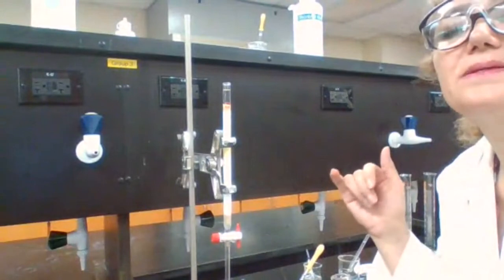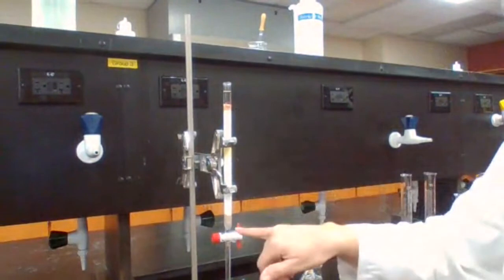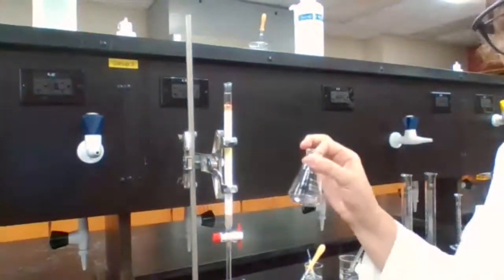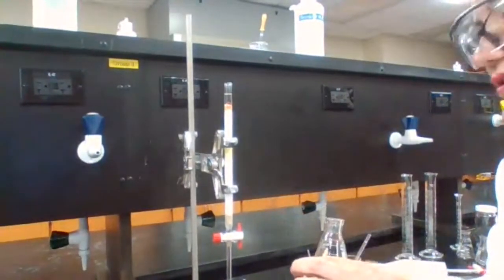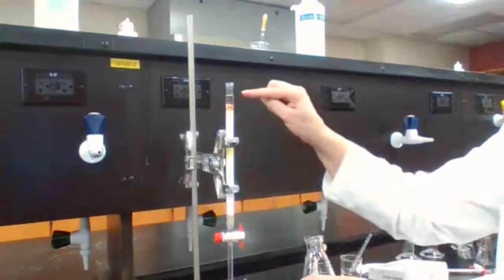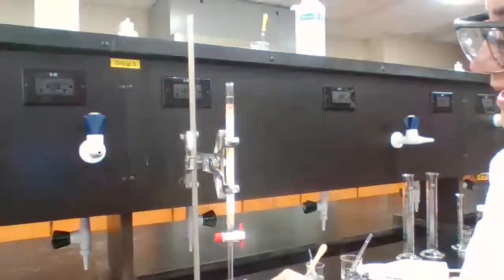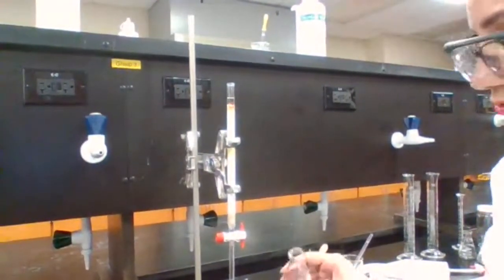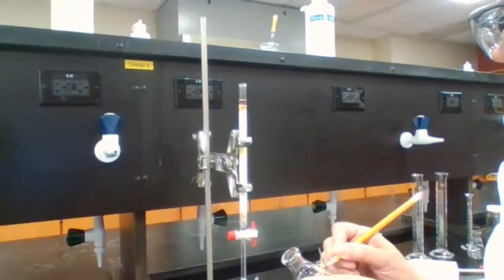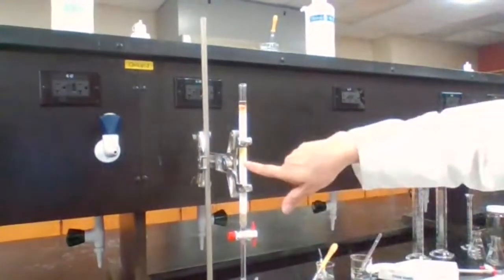When the yellow band reaches the top of the plug. So when the yellow band reaches here, all I want to collect is the yellow band. The yellow band is going to be a mixture of acetone and fluorenone, which is yellow in color. So I keep adding acetone until the yellow band reaches down here. As soon as I see the yellow color going to waste, I switch to the fraction 2 flask, and I collect in the fraction 2 flask. But not yet, it is still all the way up.